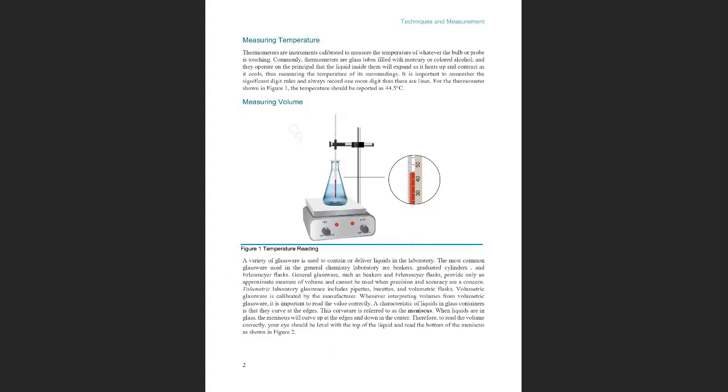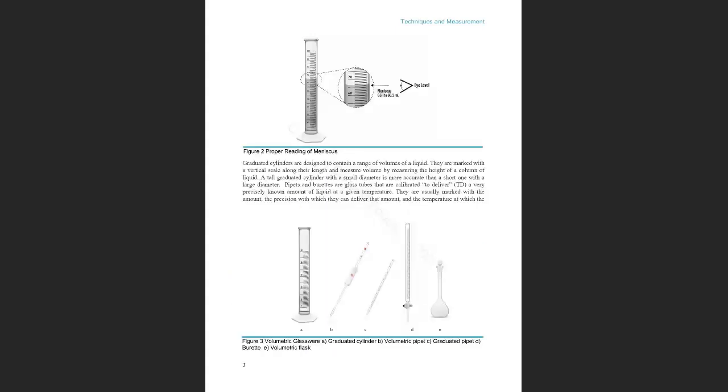So we saw measuring temperature. And let's do some practice. Here, in this graduated cylinder, it is showing how you put your eye level at the bottom of the meniscus, and they tell you that the volume is 66.1 to 66.3. Why is that?